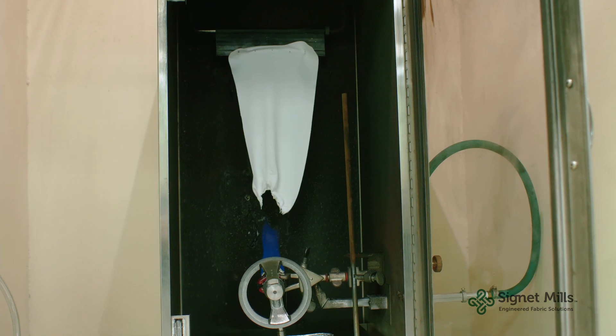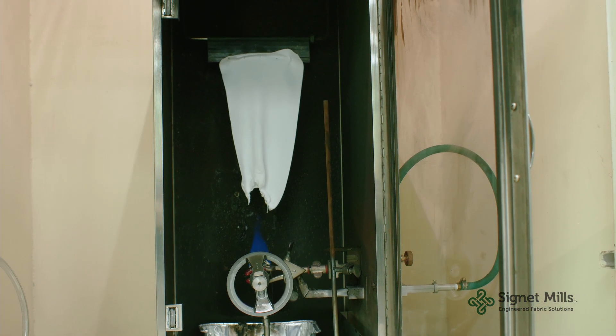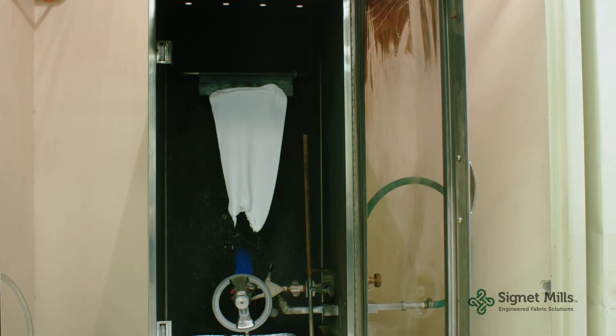So there's no more after flame. The drips have dropped. Now all we would do is go do a post weigh on it and we'll determine a pass or fail.